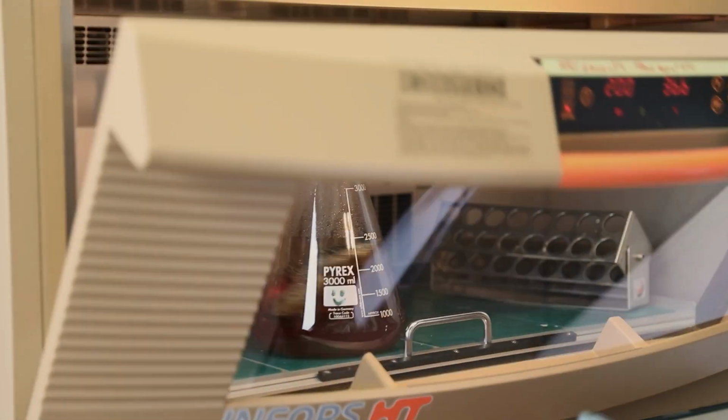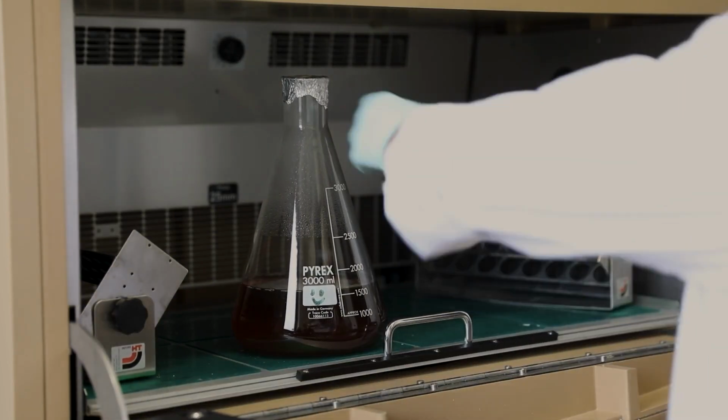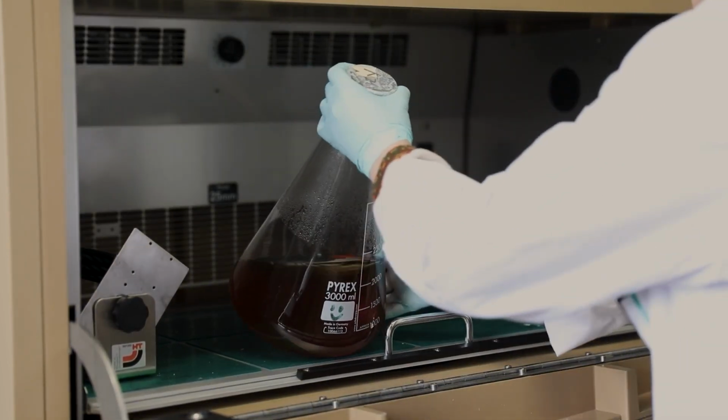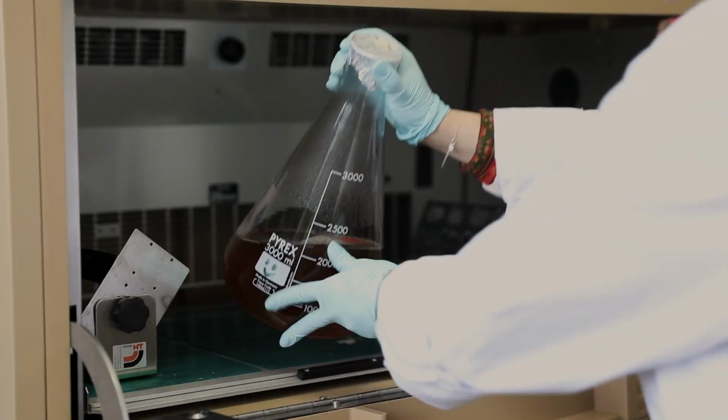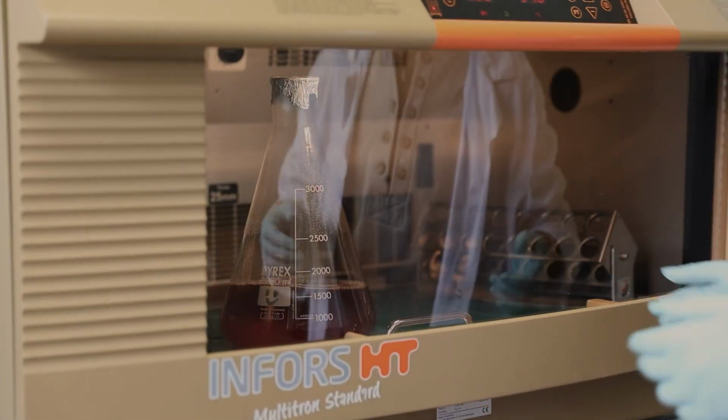The optical density of our culture is then measured. If the value is within the expected range, cells can then be induced for protein expression. Otherwise, they are put back at 37 degrees Celsius to grow until the desired OD value is reached.